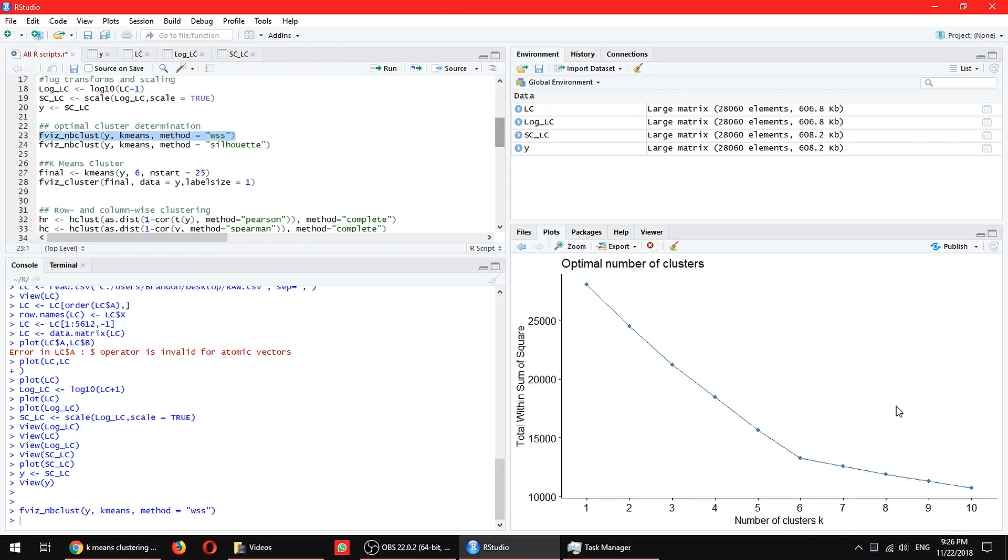That's done. So when you are done, you can actually see that the plot directly will appear in the lower right corner, which we have never used before. This place is so big for a reason because all the plots that you do will be right over here.